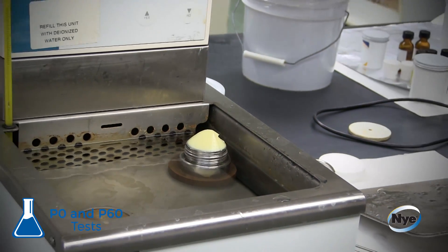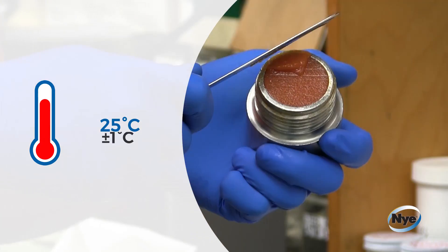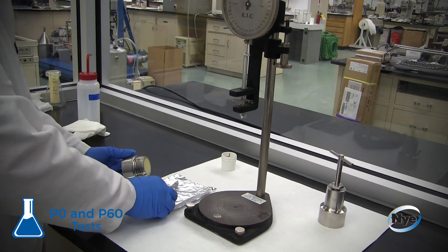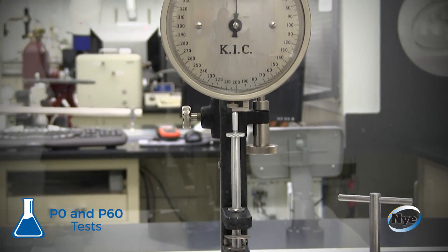The penetration test begins with the grease at 25 degrees Celsius, plus or minus one degree Celsius, being leveled into a cup. The sample size and cone weight for this test are determined by your application's needs.